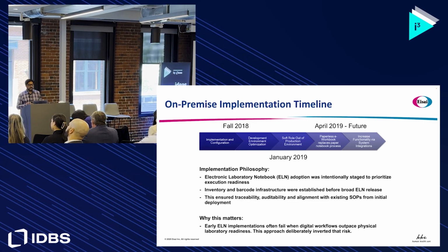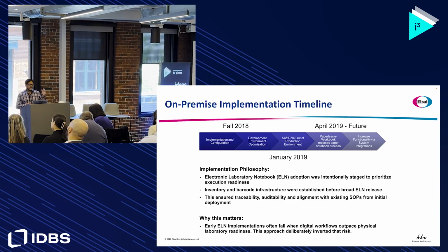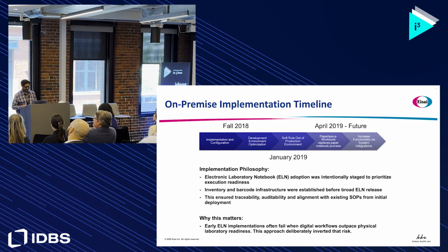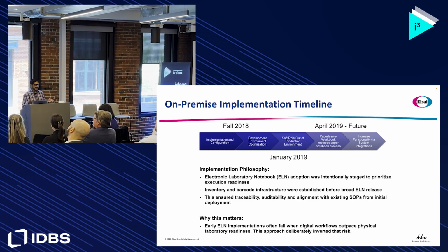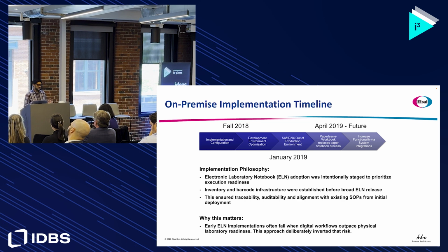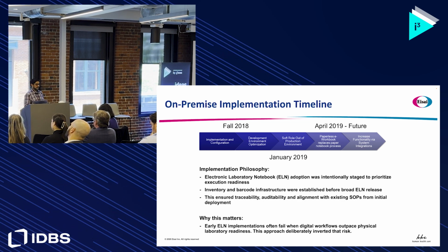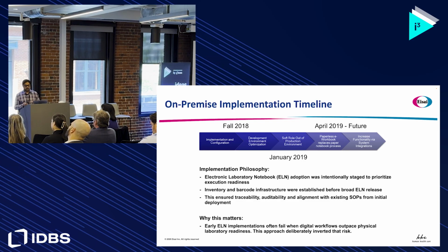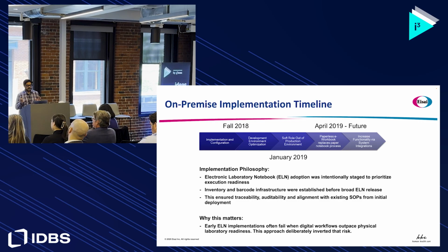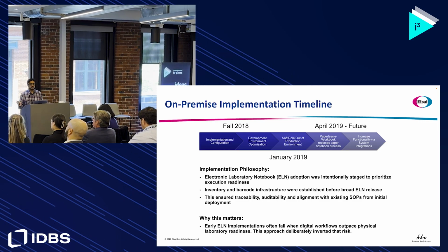We started the implementation process in 2018, and at that time we also got reorged into drug discovery. So our idea of using E-Workbook as a reagent management system evolved to, well, now drug discovery wants to use the ELN portion of it too. But we held strong with what we wanted to do, and we continued on with that reagent-first mentality, even with the pivot.